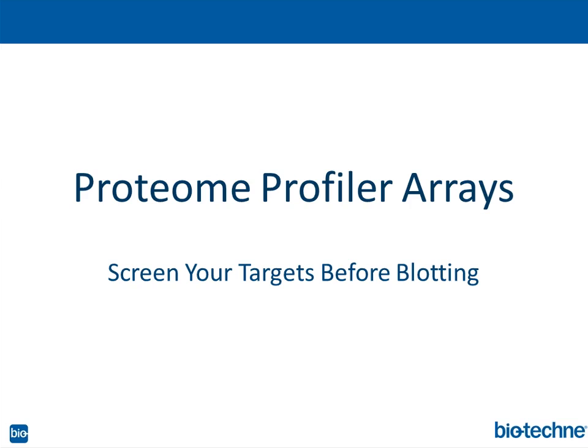When I say systems biology, it's a comparative analysis, because we tend to focus on one or two proteins. But really in biology, in the tumor microenvironment and the signaling cascade, we're talking about multiple proteins that are all talking to each other and interacting. To get a nice lay of the land, it'd be nice to look at multiple factors from the exact same sample and then follow that up with a Western blot.